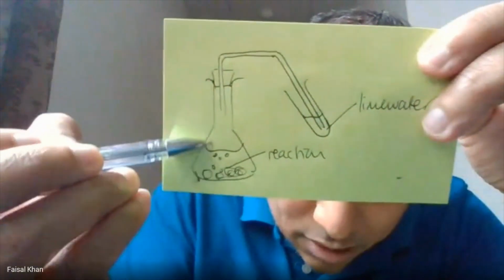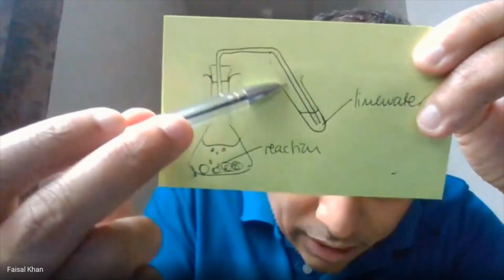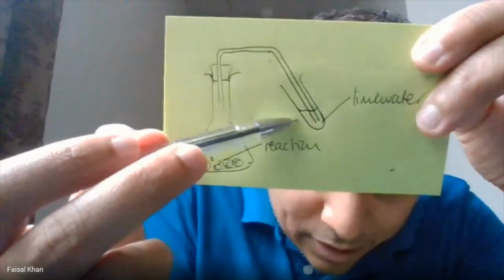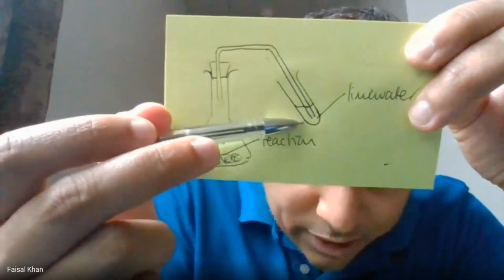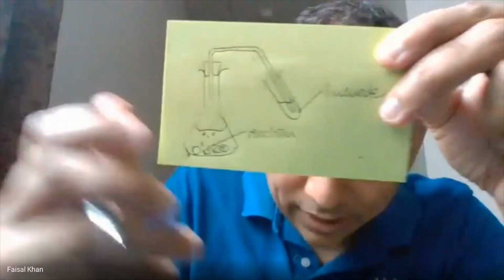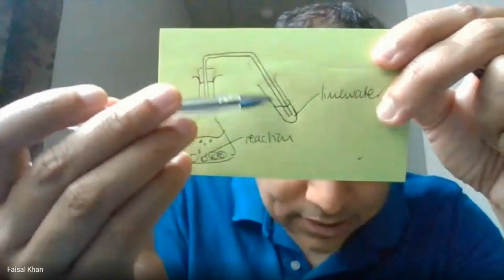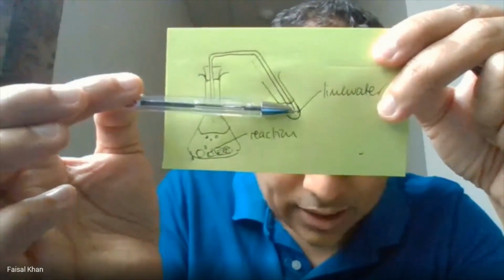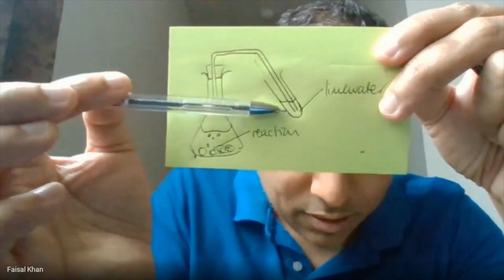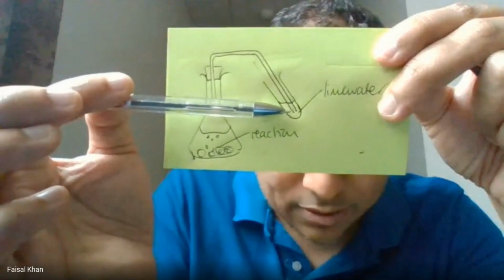And then you would have the gas bubbling through, and this liquid over here would be lime water, which is calcium hydroxide, but it's commonly known as lime water. And that would go from colorless to milky white, cloudy white, okay? All right, colorless to milky white, cloudy white.